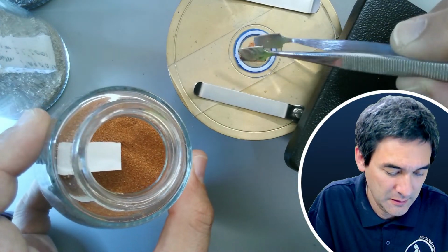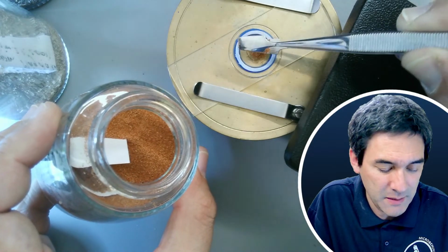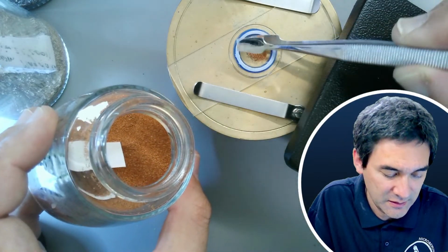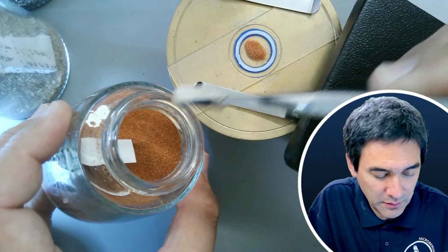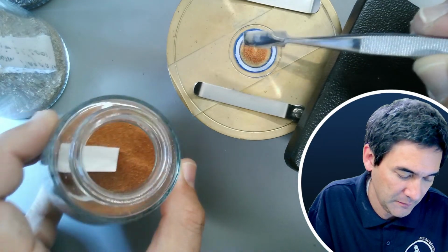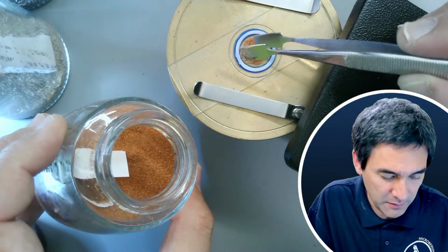Okay, so let's add a little bit of this sand here. And of course, the thickness of the spacer ring depends to a large extent on the size of the sand grains. Maybe it wants a little bit more. I don't have to fill it up completely because I do want the sand grains to move a little bit as well. Okay, let's spread it a little bit. Maybe a tiny bit more. I think that's going to be fine.